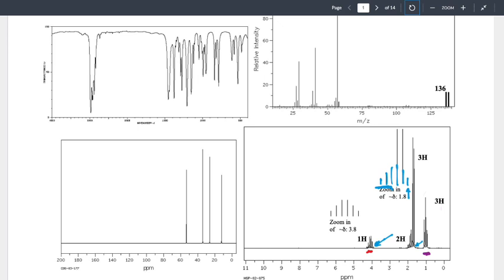To me, I'd be hesitant to say that there isn't that extra signal, because the width that I see for those 2 tall ones, those are pretty big. So those could encompass, and that's why this side is bleeding a little bit instead of going straight up. Maybe it's bleeding because there's another peak hiding in there.